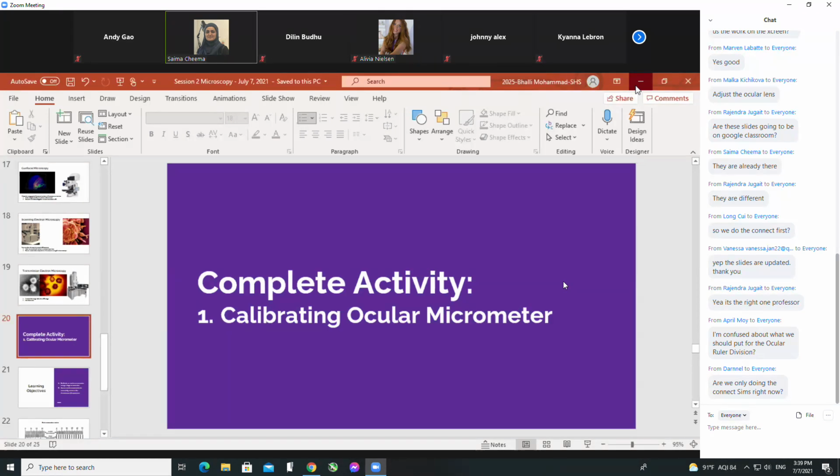Okay, so regarding the petri dish, we're going to melt a single tube and split the contents into 2 petri dishes, half and half. So if you want to mark it somehow so that you know how much is half. Okay. Are we good? Did we get it?